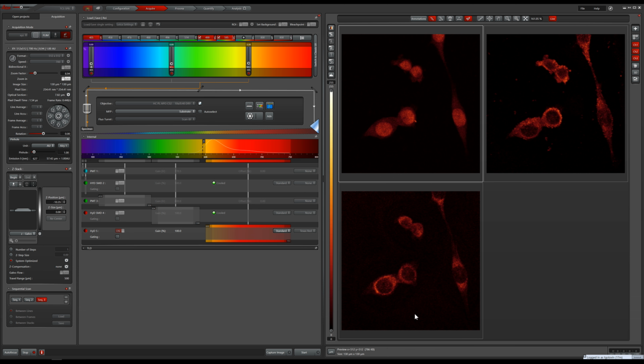To manipulate laser power, you have to select the respective sequence in the bottom left sequential scan section. You can drag the laser power slider, double-click on the number and type a specific number in, or scroll with your mouse after clicking on the slider.